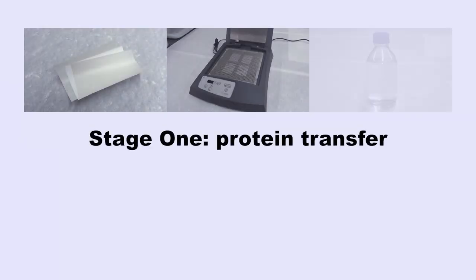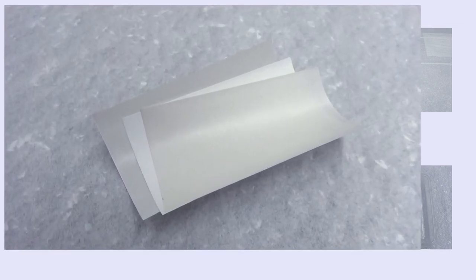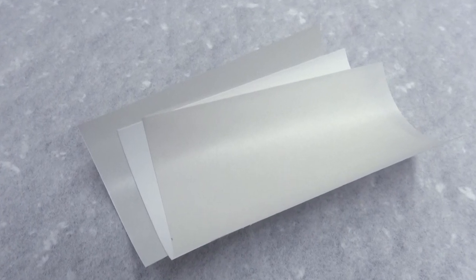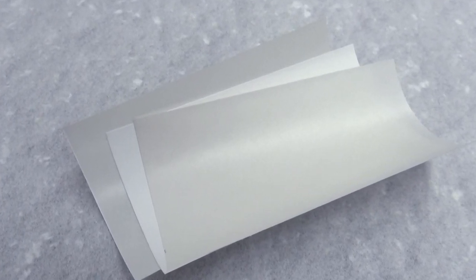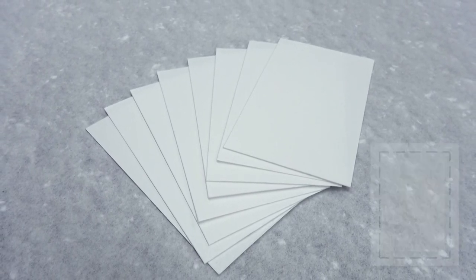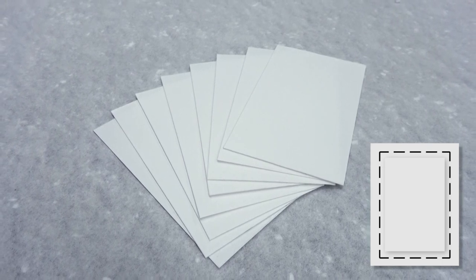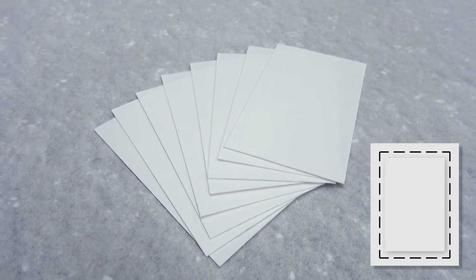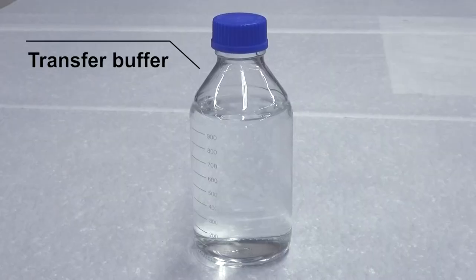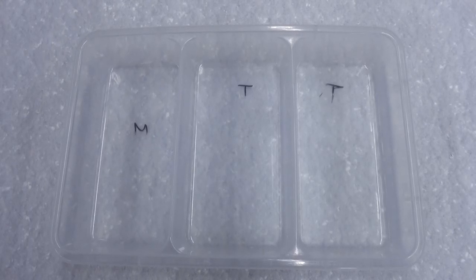Before disassembling the gel cassette sandwich, have the reagents and equipment ready. A piece of PVDF membrane of the same size as the electrophoresis gel should be prepared along with eight pieces of 3M filter paper. You may cut the filter paper to a larger size if the samples will be used for sequencing or mass spectrum analysis later. Semi-dry transfer machine, transfer buffer, methanol, a plastic box, and a plastic three-chamber container.